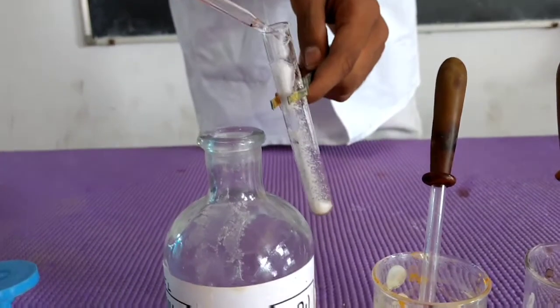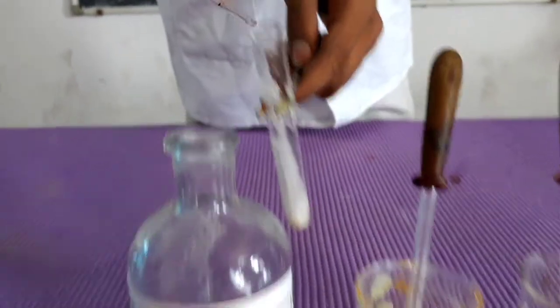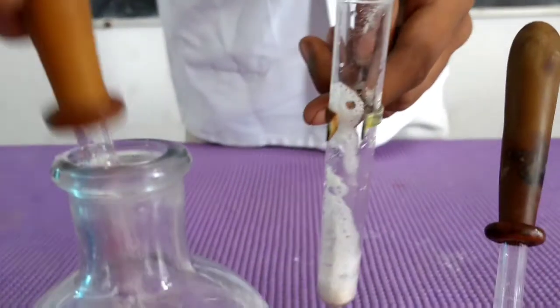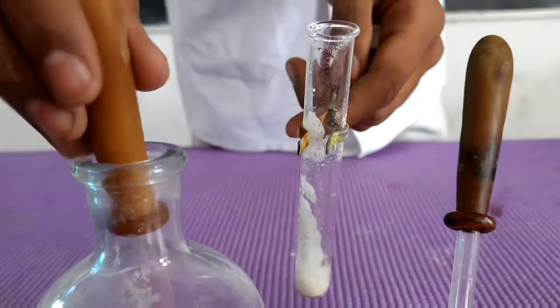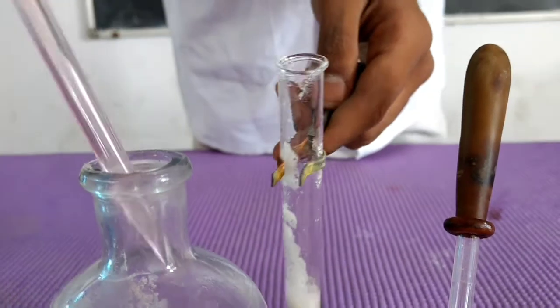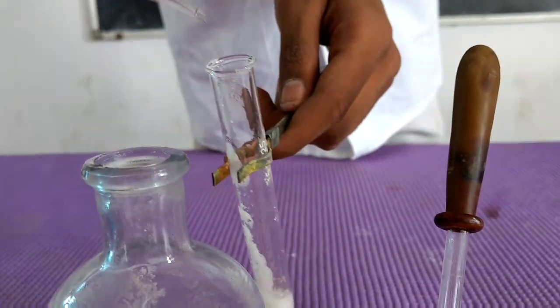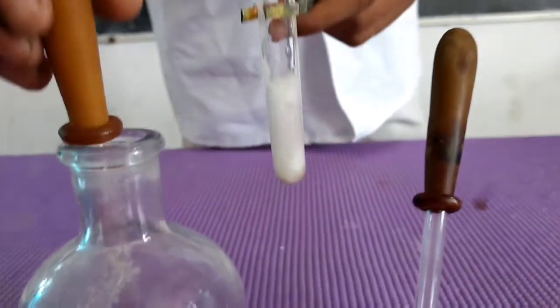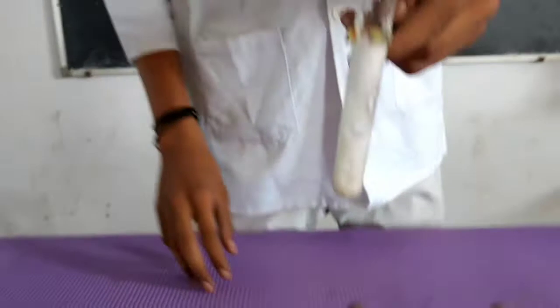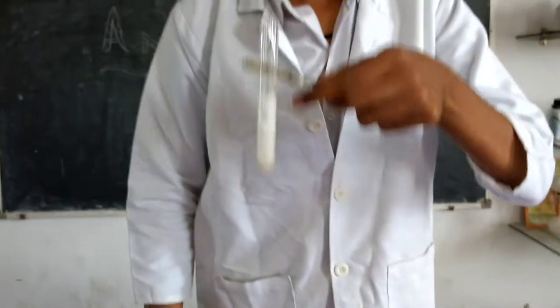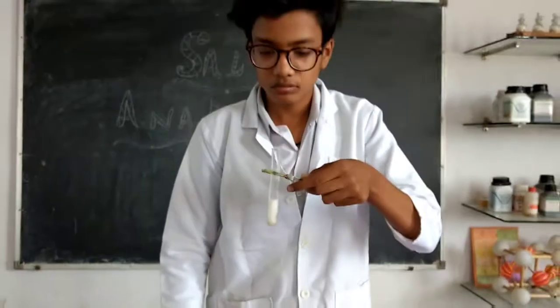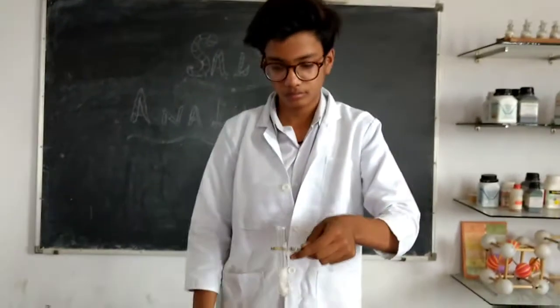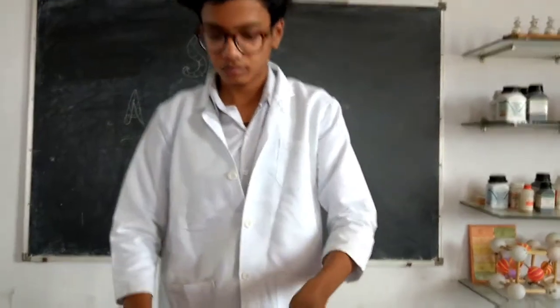He is adding dilute sulphuric acid in the test tube. You can see the evolution of NO₂ gas — light brown vapours — in the test tube.